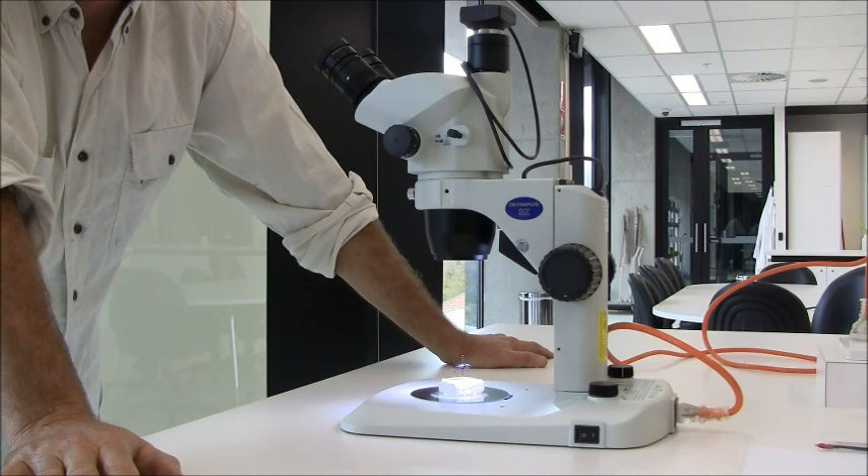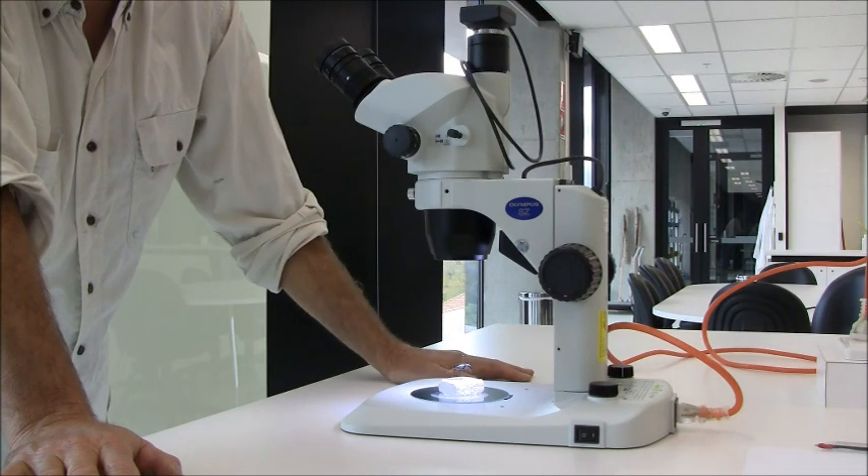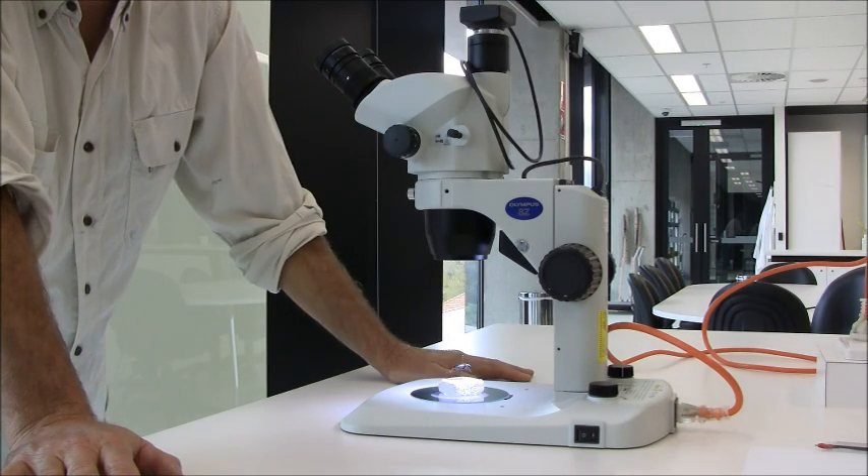The next thing that we'll demonstrate is the software. And for now, that's the dissecting microscope.